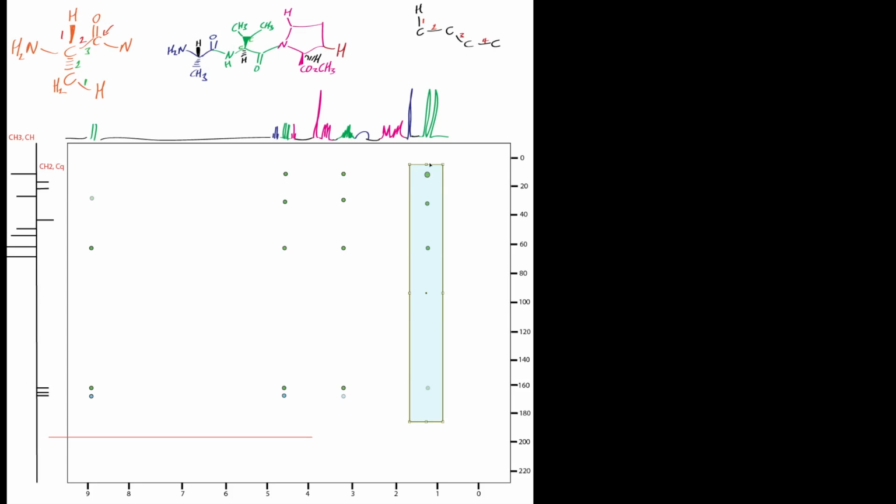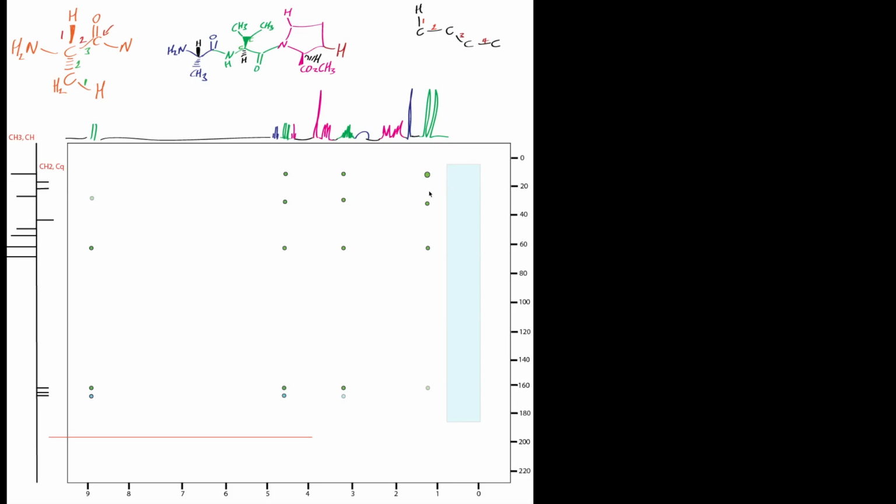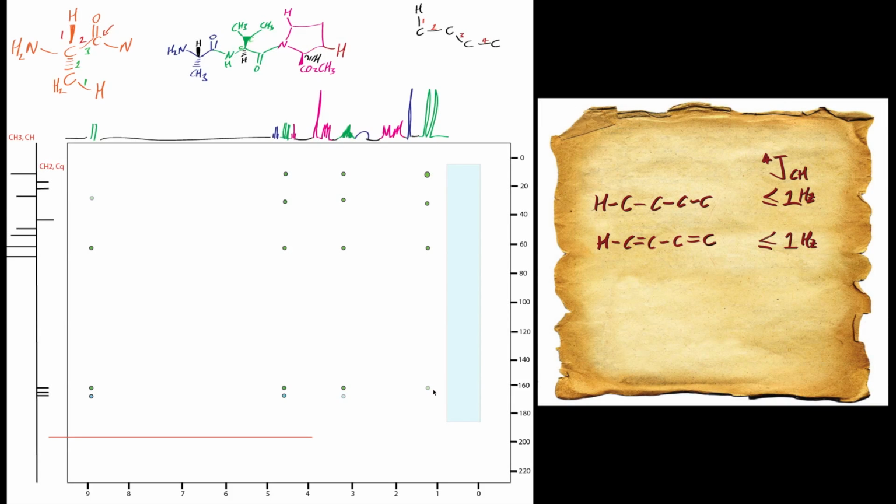Now we know that this carbon here is to do with the CH3s of the isopropyl. So let's have a look, let's go a bit further on from that. Well, first thing you note, if I just move this, because that shading's a bit confusing, I've put the grey in there for this carbonyl. Now I doubt very much you'll see that unless you really change that delta value, because if you look at the coupling here, if I just draw one of the protons in, change that to a 2, and just draw this in red.